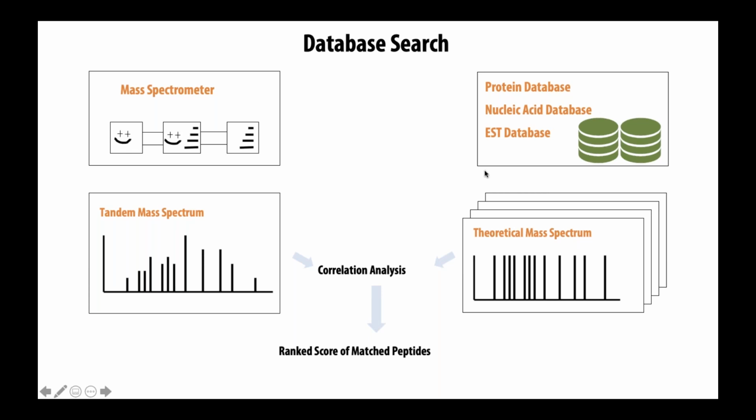So what you do is at the same time, you do an in silico theoretical mass spec experiment on your predicted proteins from the genome, right? And since we know where trypsin digests, you can take a file of predicted proteins, electronically digested with trypsin. Now you have all these digital peptides, which you can, again, computationally determine what their predicted mass would be, and then you basically correlate them. And you say, oh, well, this one is actually this one here. So this is the peptide that comes from a specific protein, right? Now you can match it to that protein with a certain level of confidence.